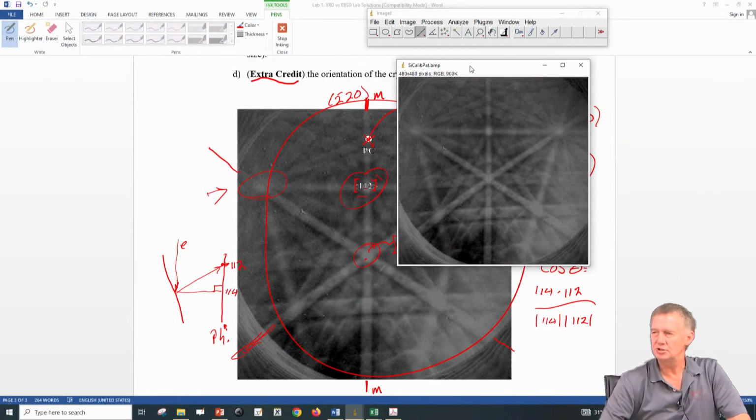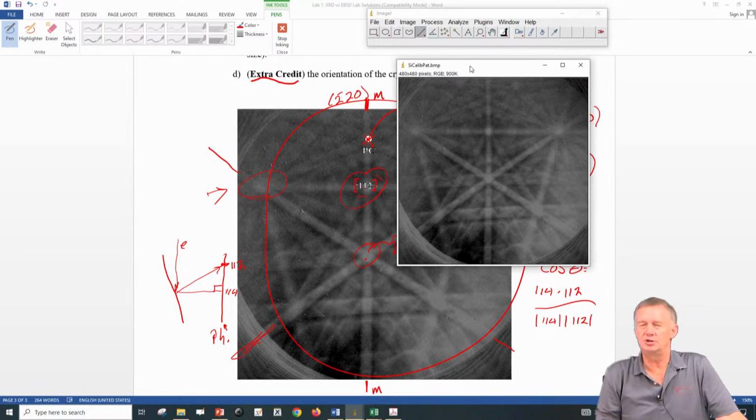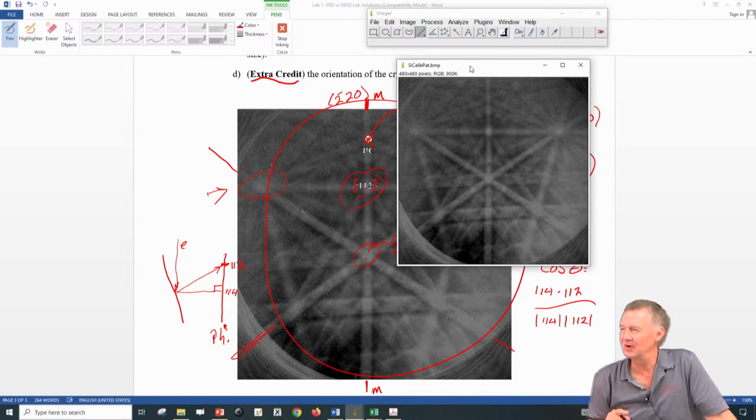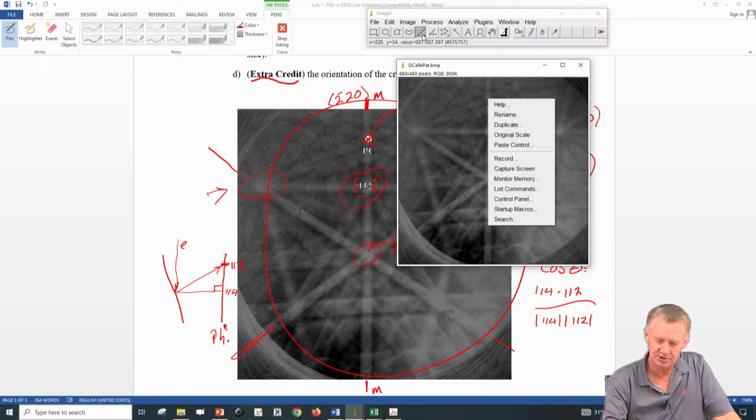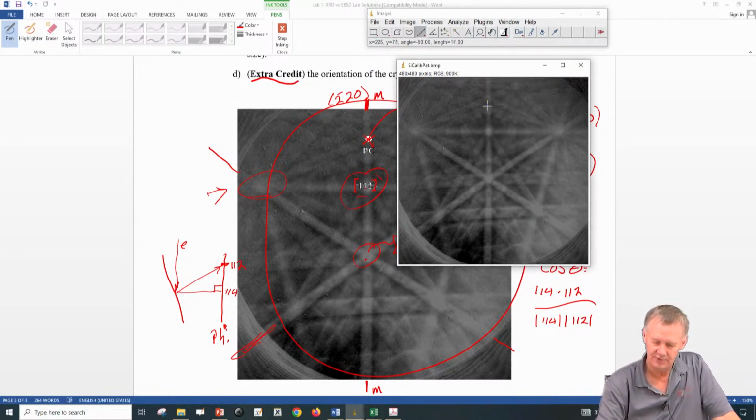So when you don't answer me, I'm feeling like everybody's lost and we should start over again. But we did one of these, you know, an hour ago, a half hour ago. So pattern center here. We're going to measure this line from here to here, which if I look up there, it says it's 87, something, 88. I'm going to call it 88.